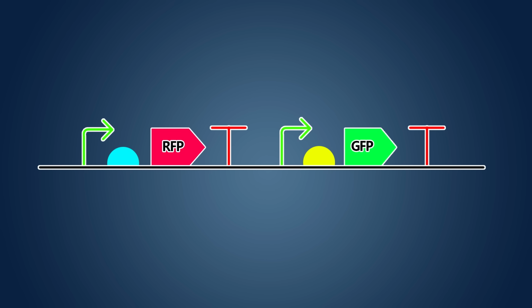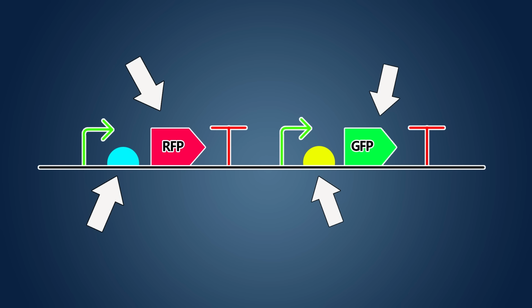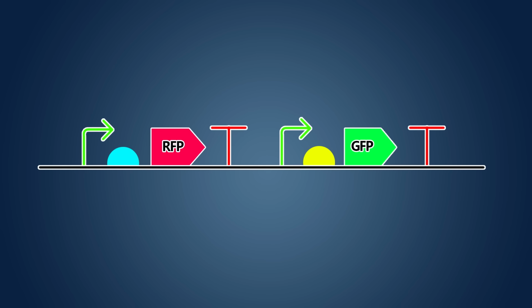To be able to see what state the system is in, I've put the same DNA binding sequences in front of two different colored fluorescent proteins, which will act as our LEDs. If the bacteria are red, they'll be in one state. If they're green, they're in the other. But we shouldn't see any bacteria that are yellow, meaning that they're producing both proteins at once.